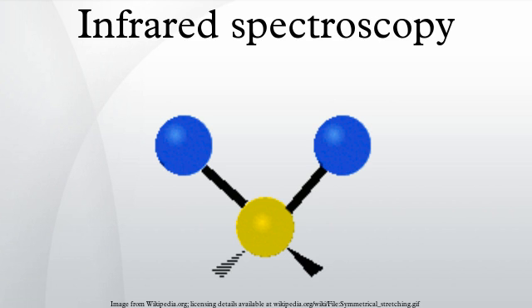The final method is to use microtomy to cut a thin film from a solid sample. This is one of the most important ways of analyzing failed plastic products, for example, because the integrity of the solid is preserved. In photoacoustic spectroscopy, the need for sample treatment is minimal.